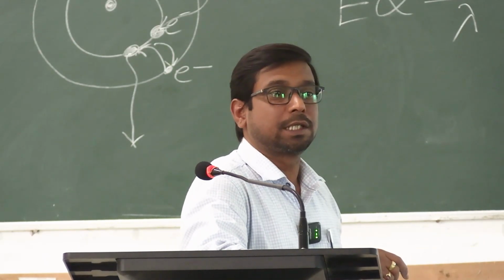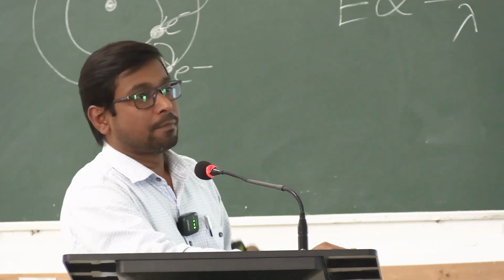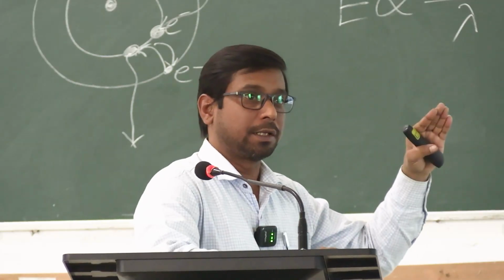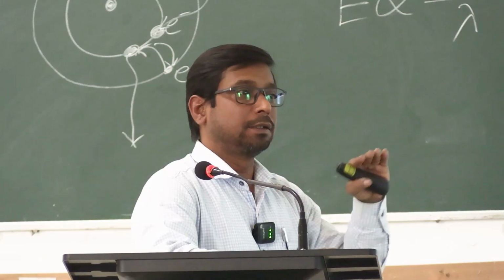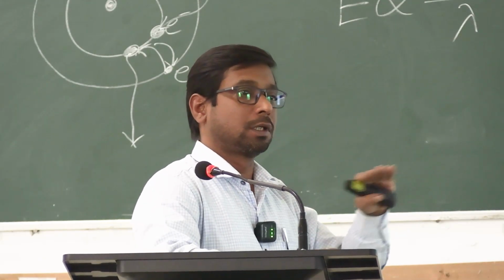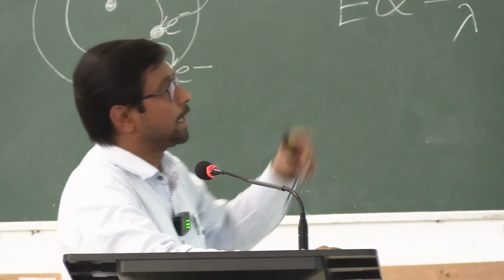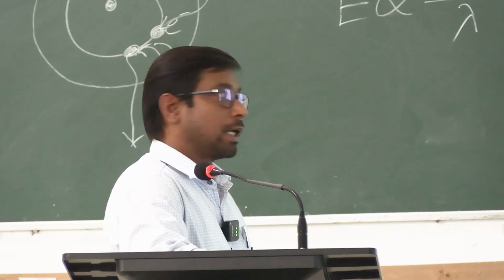Whatever that 3D structure is, we can find it, but through transmission we can find the inner side structure. Sample preparation is also different. We have to cut the sample for transmission electron microscopy into very fine microscopic particles. We have to use diamond knives to cut the sample, and then we can find the inner structure of that particular organism.